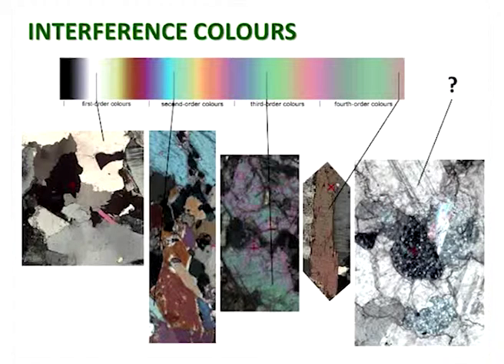So this is really going from greys, which is typical first order colors, and then hornblende, particularly amphiboles, shows a lot of first order reds and oranges and yellows, but its maximum color will run up to something like in this second panel here, which is a kind of bluish or even slightly bluish green, like this one down the bottom here. Third mineral here, this is actually epidote, and epidote has rather psychedelic colors.